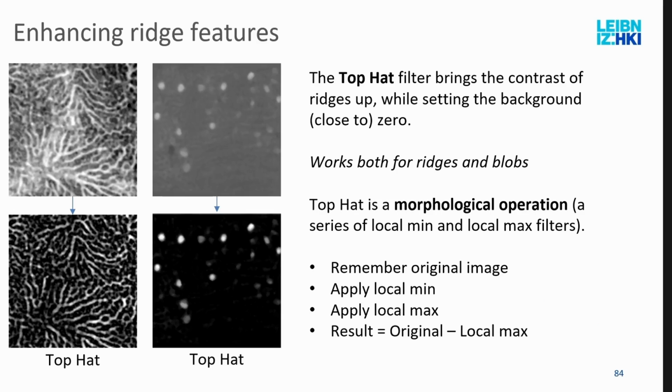So for example, the top hat filter is one of those that you can see here from the liver data: it pushed down the background a lot and then really nicely highlights these canaliculi. And the same here for the glomeruli data, for the kidneys, it almost completely got rid of the background, and they are super nicely shown now in the data.